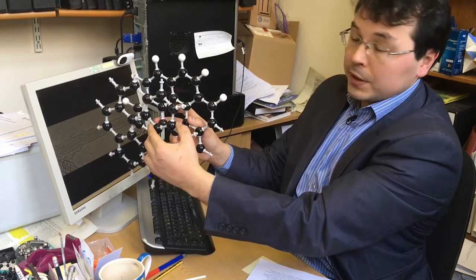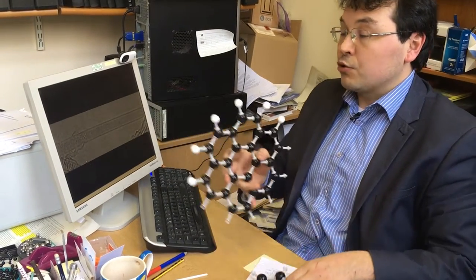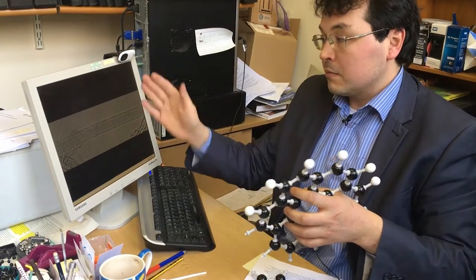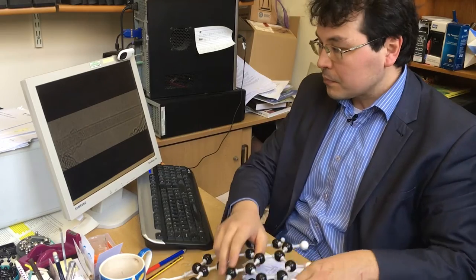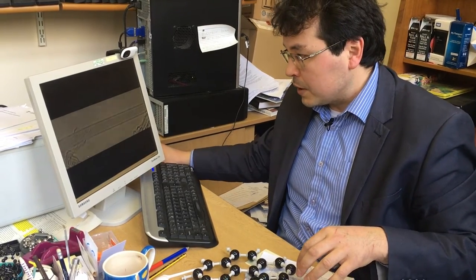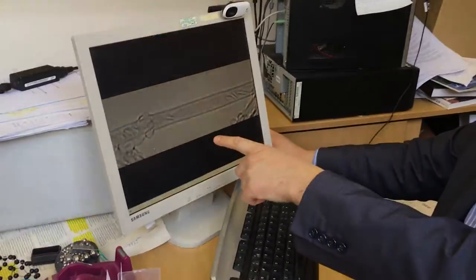So when we take the movie, we are looking at this molecule edge-on, and they appear as short vertical lines stacked like a stack of pancakes within the nanotube. As we play this movie, we can see that these molecules are not still. They're moving around. They're changing their orientation.